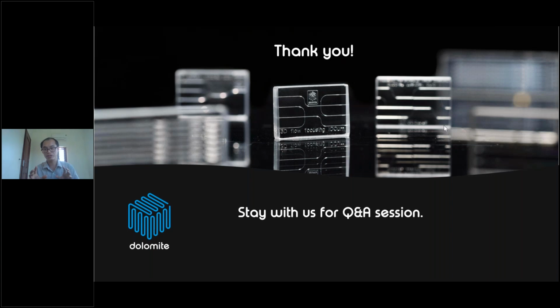It will be affected by chip geometry and the flow rate ratio, but the total flow rate, as I showed in the experiment results, doesn't strongly affect the particle size. So mostly we control the particle size by controlling the flow rate ratio between the two streams, and also by using different chip geometry. I hope it helps.